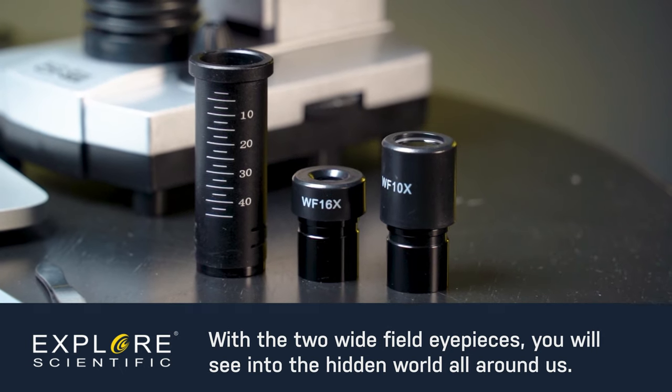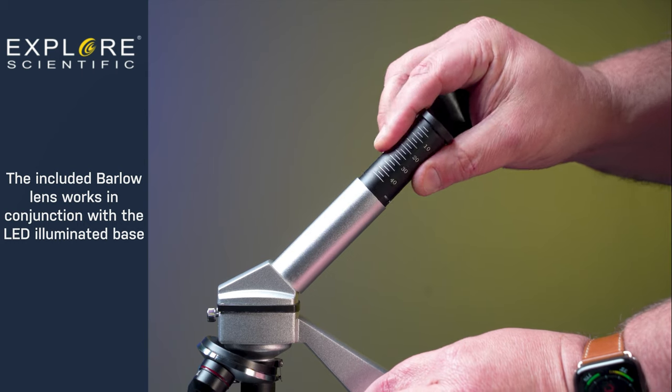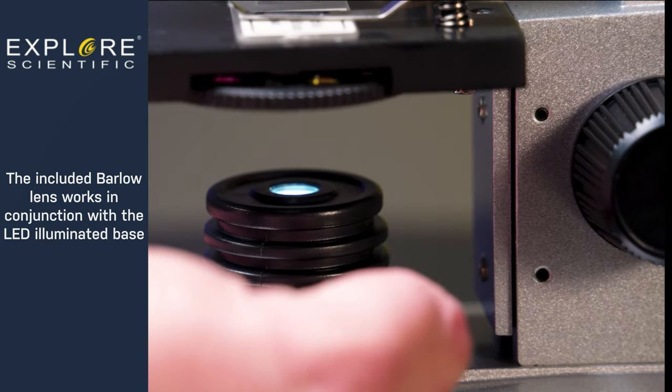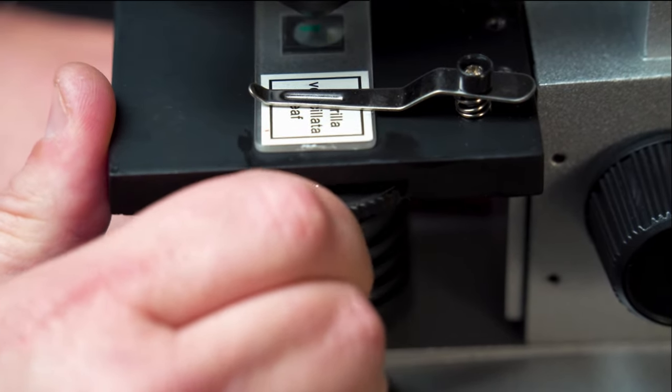With the included two wide-field eyepieces, you will see into the hidden world all around us. For a more in-depth and closer image, the included Barlow lens works in conjunction with the LED illuminated base. Use the built-in color filter wheel to make images pop that need extra contrast.